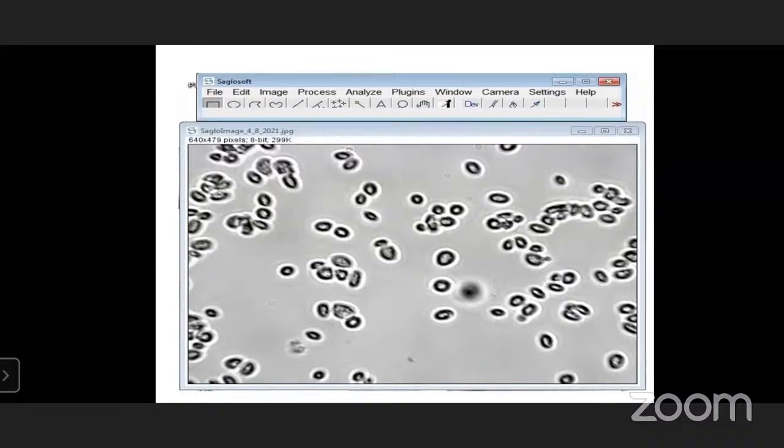Okay, this is the first point regarding the camera and capturing. Okay, second point is if you want to record that particular image, so you get the recording by using a particular point called capture recording. Okay, click the capture recording, then you get a recording of that particular image.